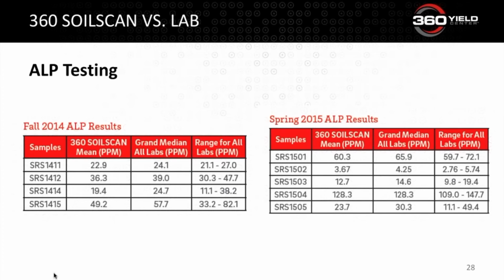We've got 3 years of data, and I just wanted to share, just to remind you that if you look, that left column is the SOILSCAN, that's 2014. And then they send this out and compare it to a number of labs.